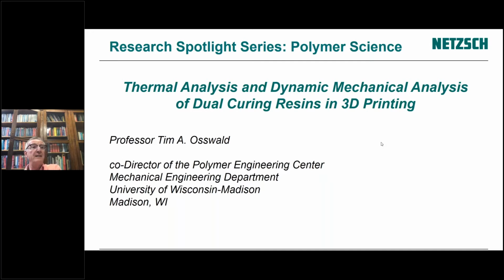Oh, yes, and that's a whole other area. DSC can do a very fast heating of a sample, and we can go up to even 150, 180 degrees C in no time and then do an isothermal analysis. And the software will take care of any losses that occur during the initial fast heating ramp. So yes, and we've actually done a lot of work on that when we did some analysis of epoxies.